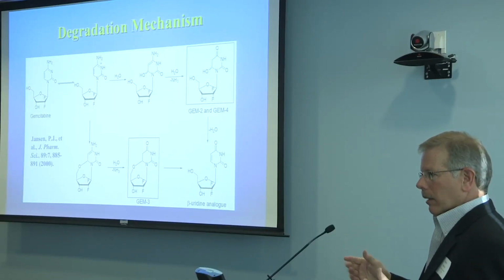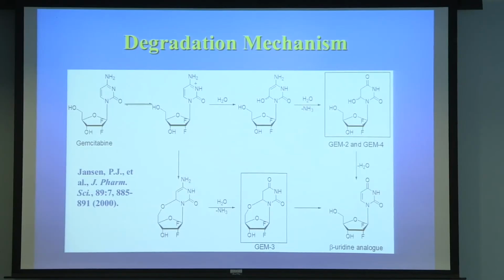But the important thing to emphasize there is that you've got to look at the chemistry and not just peaks in a chromatogram. As analytical chemists, it can be tempting to just throw techniques at it, and don't forget to look at the chemistry. And this is the total chemistry that we elucidated, and you can see there are actually some of these peaks with no chromophore, or very low chromophores, and so you wouldn't even detect them. So you have to go to very low wavelength.